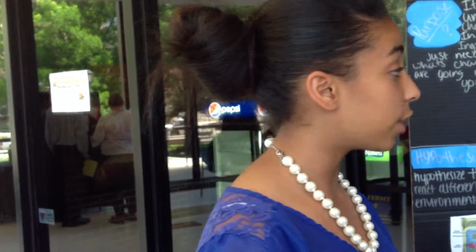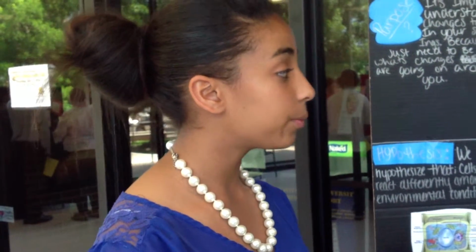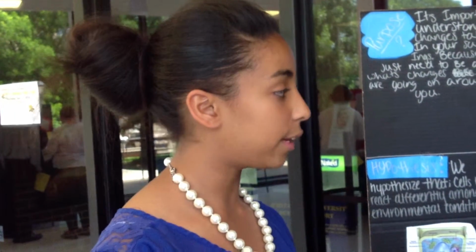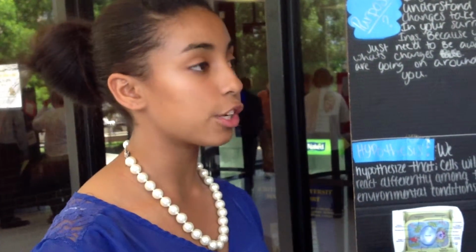The results were that dry cells ended up as a concave polygon because of the water loss. Cold water was more round because it lost its shape as it expanded. Hot water had a thicker cell wall because it was trying to keep the heat from going into the cell membrane. And the room temperature water was our standard polygon. Our conclusion was that every cell reacted differently among the different environments.